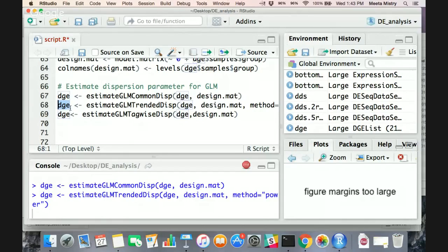So in this format, when you're renaming DGE, you're not replacing it, you're just adding to the object. Yeah, it's very interesting because normally in R, if you were to do that, you'd actually overwrite. Okay, yeah, that helps me out a lot. I've seen this code before and that totally confused me. Yeah, so that's really helpful. Thank you. No problem.